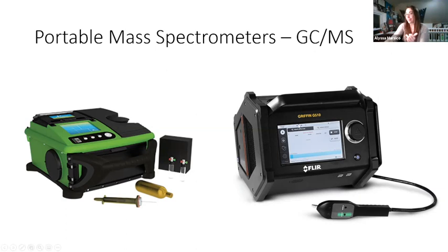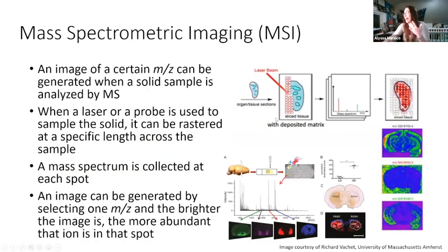One other cool area of mass spec, like I've already talked about, is mass spec imaging. I think imaging is really cool because it gives you a really neat demonstrative capability in a courtroom. Mass spec imaging works very well with laser-based techniques, or desorption electrospray ionization. It works well with techniques where you can ionize or sample a very small area, then move over and sample another small area. It's easiest to describe this with a laser, right?